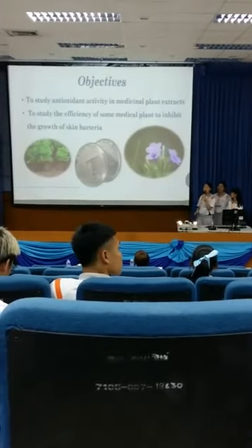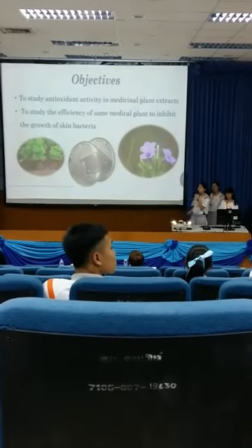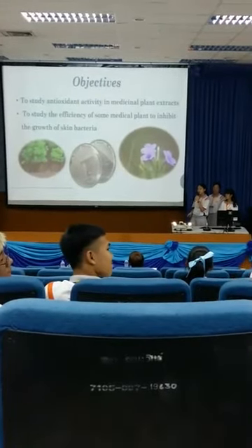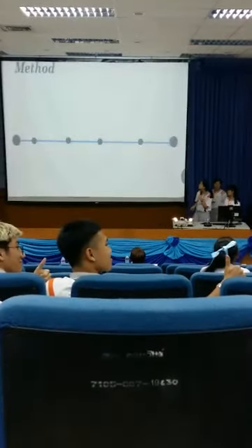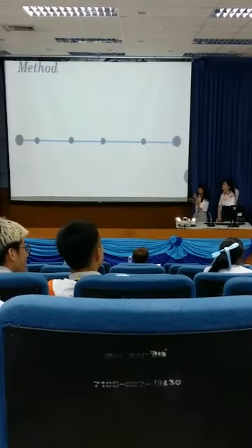And our objectives: the first one is to study the antioxidant activity of some medicinal plants. And the second one is to study the efficiency of the medicinal plants to inhibit the skin bacteria. Method: we divide into 4 steps.